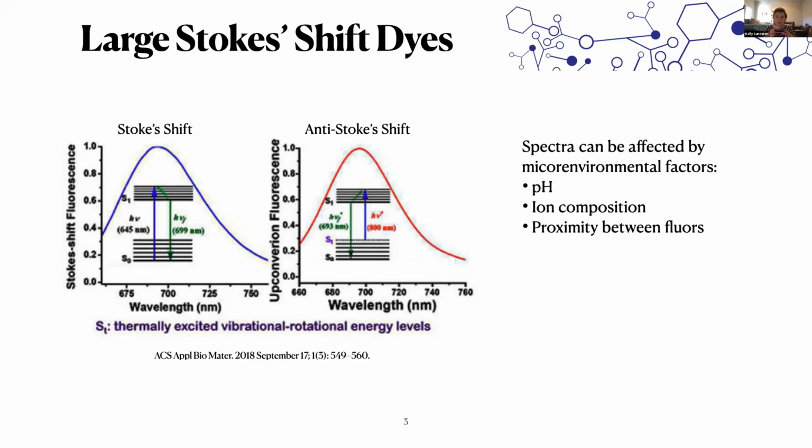For most applications, the fluorophore is surrounded by the antibody, so it's relatively protected from the rest of its microenvironment. But that's definitely not true, nor would you want it for a lot of indicators. Any sort of chemical indicator that you're going to use for live cell imaging is not going to be protected like that by a bunch of protein, which is why we can benefit from sometimes its shift in spectra.